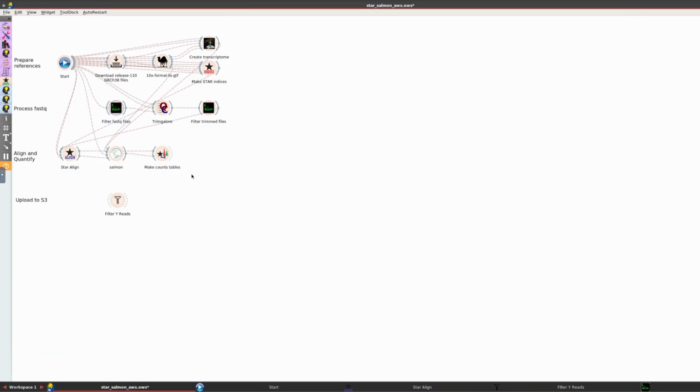That concludes this video. Hope this video provides you with enough information to run this workflow.